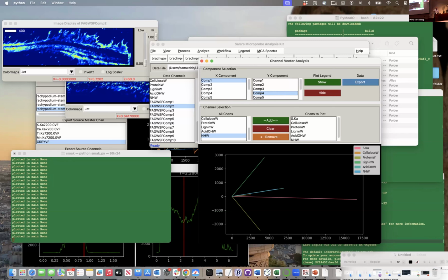I'm getting dramatically close to the end of this 2 hours. It's flown by and everyone's still awake. So I think I'll stop and ask if we have any other questions to satisfy everyone. Hopefully this has given you a little flavor of how to mold those data together. It's a start. It's a good process, I think, and it's a thing that we're going to constantly be developing on. As we get more modes of data, these processes will get refined and get cleaner and easier to do. Do we have a microphone?